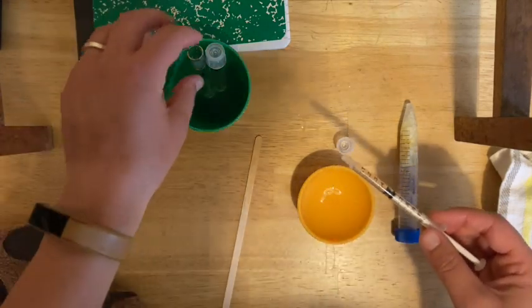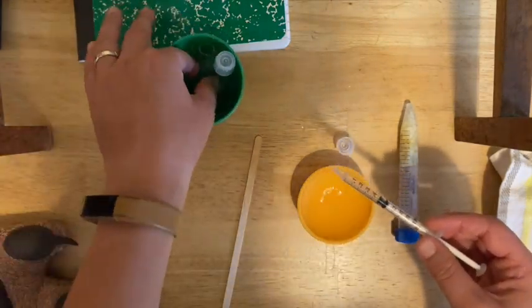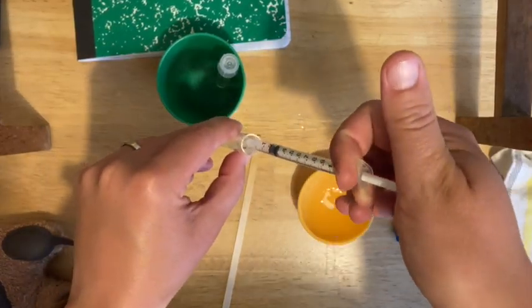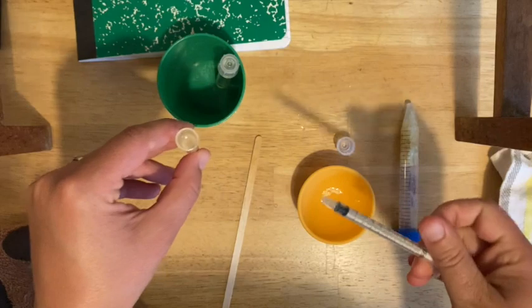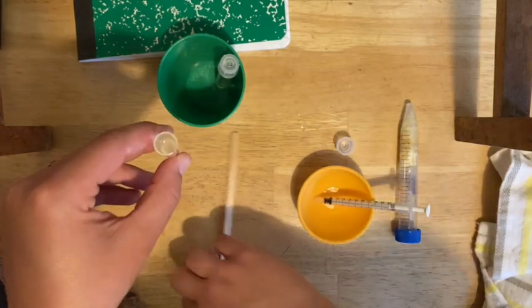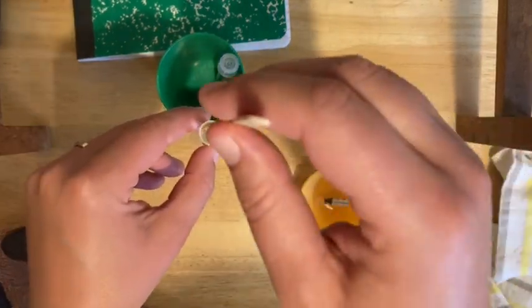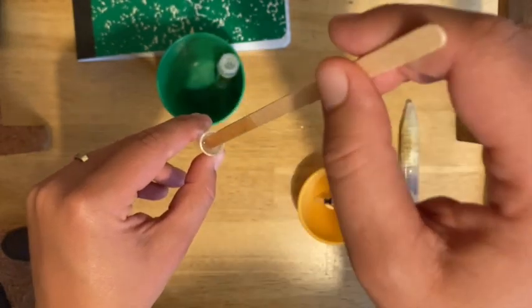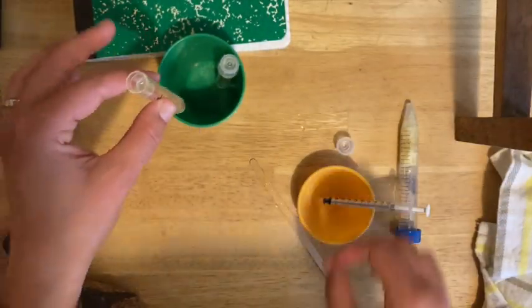You've got your 0.5 milliliters. Take your plus bromelain tube and add that in there. You can use the same stir stick since it was only in the control before. Give it a nice stir and you're all set.